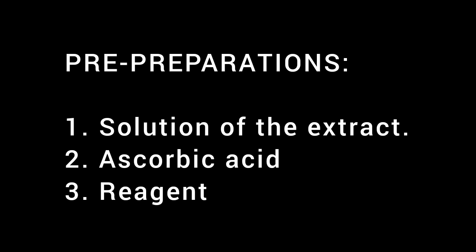Next, you have to prepare reagent by adding 1.97 mg DPPH in 50 ml methanol, right? So we give it an incubation of around 2 hours because its absorbance is unstable, and within 2 hours it will get steady. Afterwards, we have to fix its OD at 1, and optical density is measured at 517 nanometer.